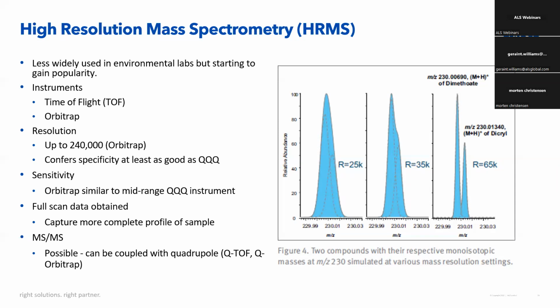And then there's another technique called Orbitrap, which is provided by Thermo. So those are the two main techniques that are part of high-res MS. We're currently working on approaches for determining high-res MS, and how to communicate the certainty in the kind of data you get back, how you identify and quantify the PFAS. We're doing quite a lot of work on confidence limits using this high-res MS approach, and maybe that could be the subject of a future presentation.